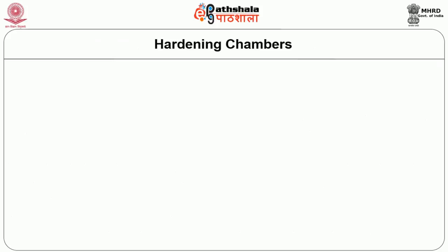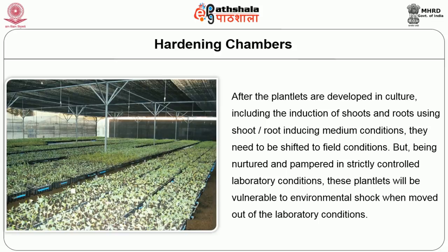Now let us take up the hardening chambers. After the plantlets are developed in culture, including the induction of shoots and roots using shoot or root induction medium conditions, they need to be shifted to field conditions. But being nurtured and pampered in strictly controlled laboratory conditions, these plantlets will be very vulnerable to environmental shock when moved out of the laboratory conditions.